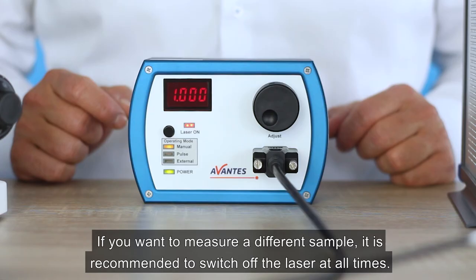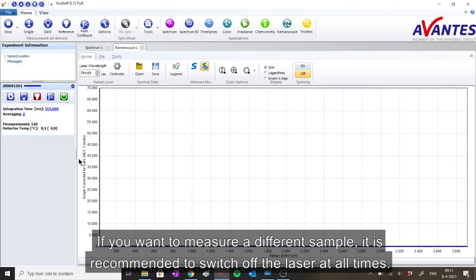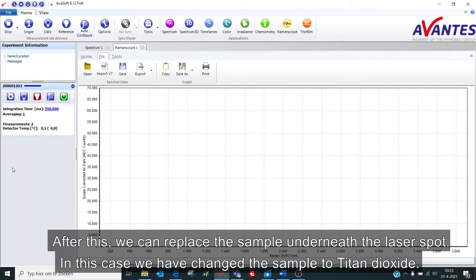If you want to measure a different sample, it is recommended to switch off the laser at all times. After this, we can replace the sample underneath the laser spot. In this case, we have changed the sample to titanium dioxide now.